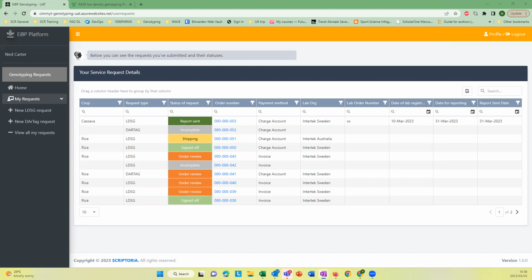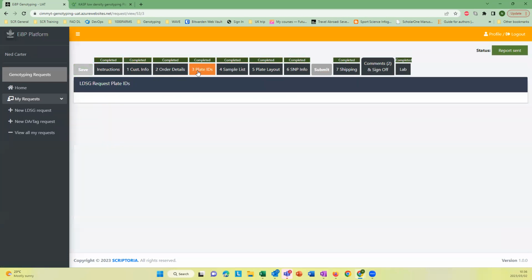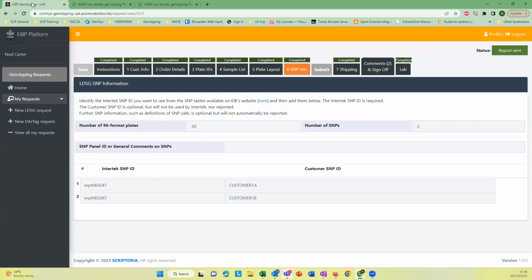There are two questions in the chat box. One is from Bashir. It's asked like, based on what you choose the SNP ID. So I provided the CAS link in the chat box. You can go to the particular crop and you choose your trait of interest, and then you can choose that particular SNP corresponding to your gene of interest. So that's for Bashir. And there is one more question from Virendra Babu. Is there any option to select few SNPs at a time? We are not very clear, Virendra. Can you ask that question in person, please?